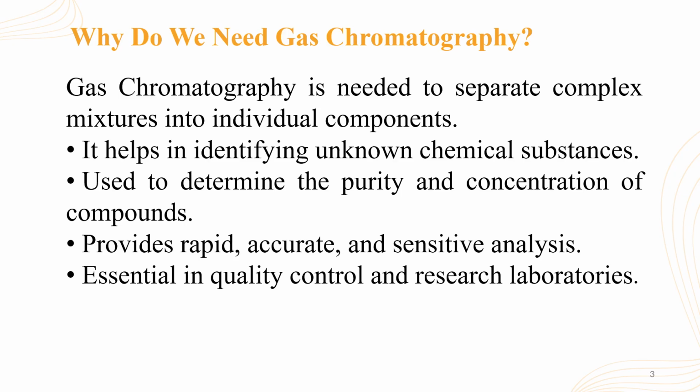It also helps in identifying unknown chemical substances. Another important use is determining the purity and concentration of components. Gas chromatography provides rapid analysis, accurate results, and high sensitivity. This is why it is widely used in quality control and research laboratories. The image shown here represents how different chemical compounds are separated and analyzed individually.